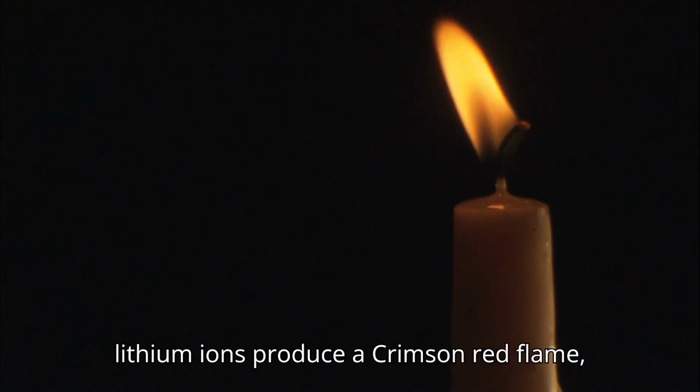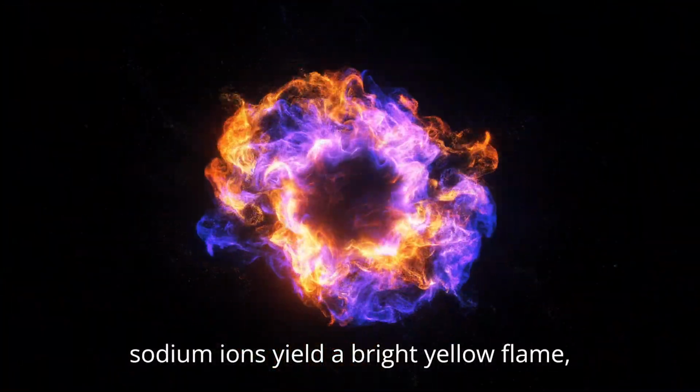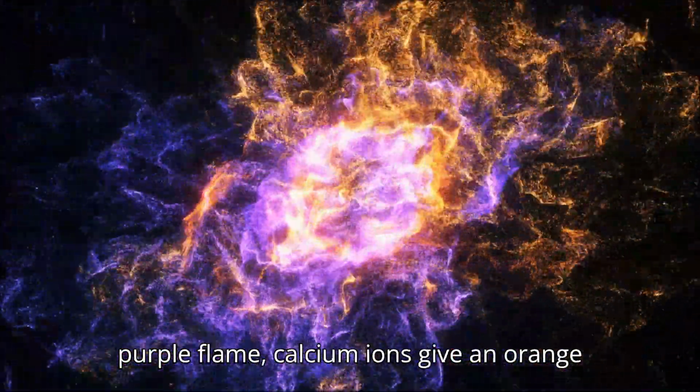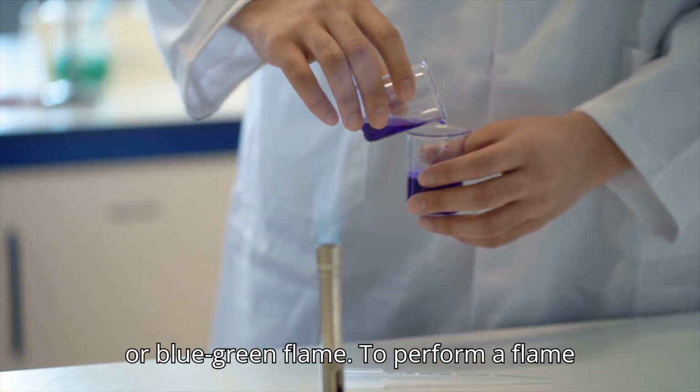As the electrons return to their ground state, they release energy in the form of visible light, and the color of this light is unique to each metal. For example, lithium ions produce a crimson-red flame, sodium ions yield a bright yellow flame, potassium ions produce a lilac or light purple flame, calcium ions give an orange-red flame, and copper ions create a green or blue-green flame.